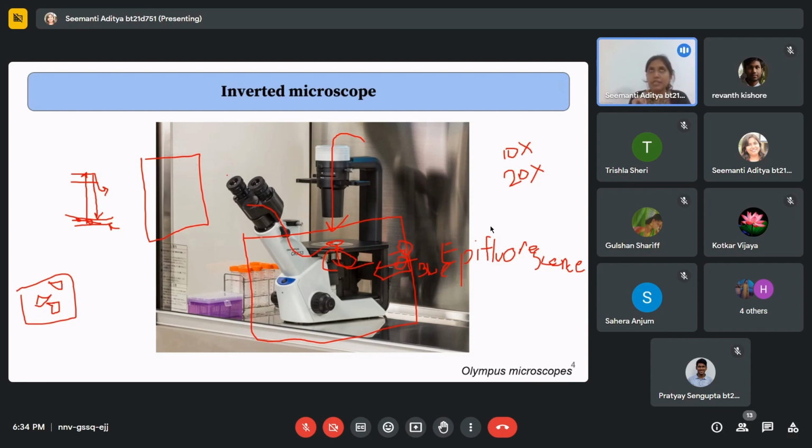Also, sometimes a bright field microscope can be used for seeing whether cells are differentiated or not. Suppose we are working with neuronal cells. If they are in an undifferentiated state, they are going to look like this, but if they are differentiated, they will show branching like this. So we can observe that in a bright field microscope and say that, okay, our treatment is working. Our cells which were earlier not differentiated are now getting differentiated because they are showing branches, because of the axon fibers and all those things. Those things we are seeing only with a bright field microscope.